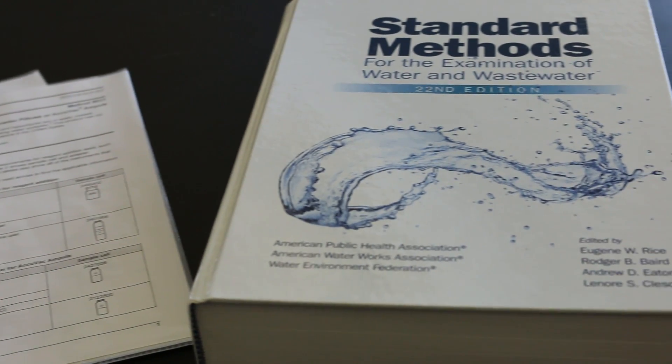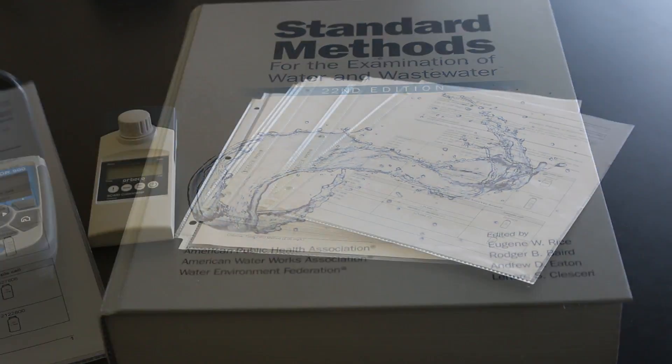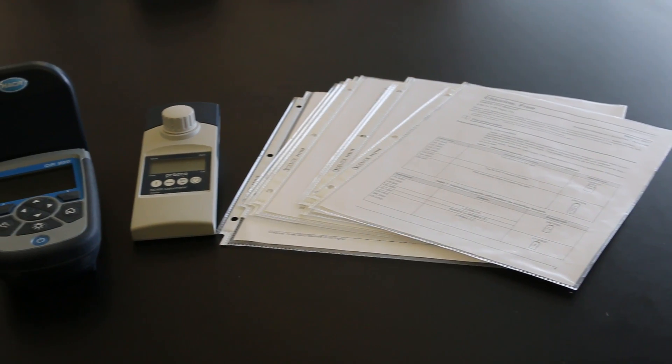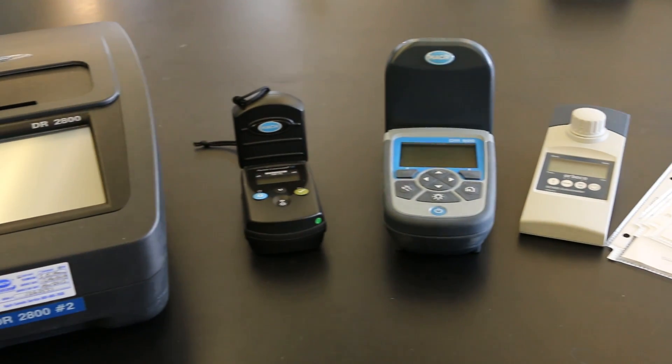The method we are following is adapted from standard methods for the examination of water and wastewater. It is used for testing free chlorine, which is the amount of hypochlorous acid and hypochlorite ion found in a drinking water sample.